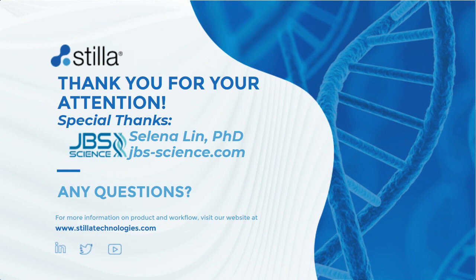So when we run the dimer checks like what we discussed in the presentation today, we're doing a pairwise analysis. As we get into more and more complex multiplexes, there's numerous interactions that can occur, and it's not necessarily just a pairwise analysis. So what could be going on is that there are predicted dimers, and there are dimers that are not predicted to form that are actually forming. This could be due to the high level of nucleic acid within the reaction. It also could be due to a multi-configuration, so maybe multiple oligos, more than two, are coming together to form these dimers. There are ways to help relax these dimers and restore some of that efficiency. So if you do run into situations like this, feel free to reach out, and I'd be happy to direct you to workarounds for those scenarios.